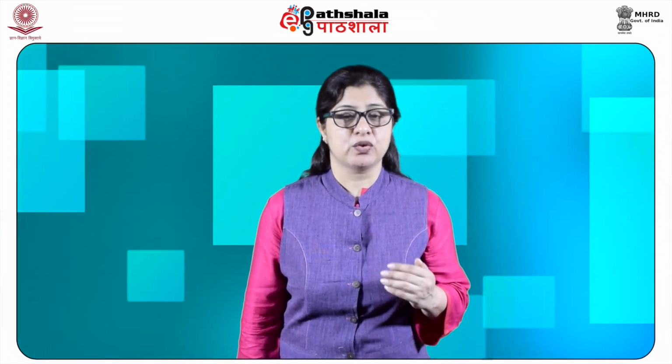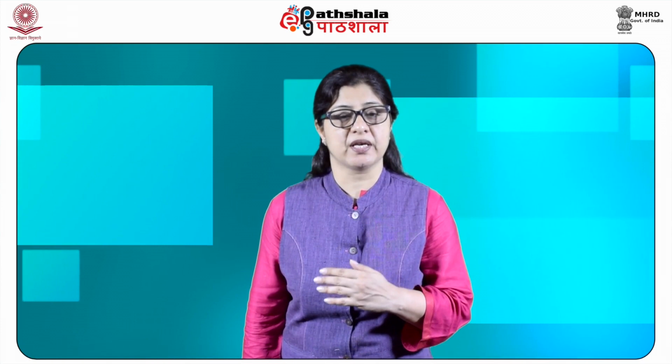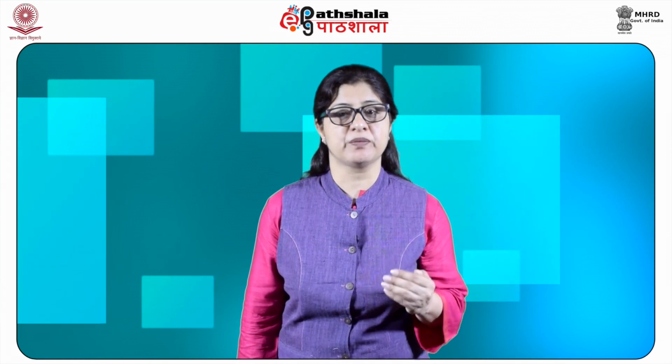Ion exchange separations are mainly carried out in columns packed with the ion exchanger. There are two types of ion exchangers, namely cation and anion exchangers. Cation exchangers possess negatively charged groups and these will attract positively charged molecules. These exchangers are also called acidic ion exchange materials since their negative charges result from the dissociation of the acidic group.